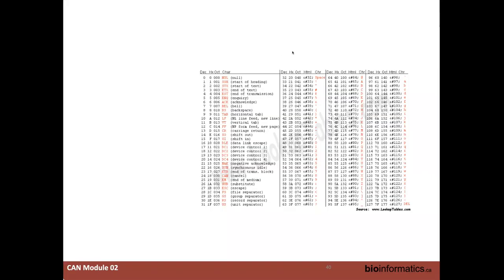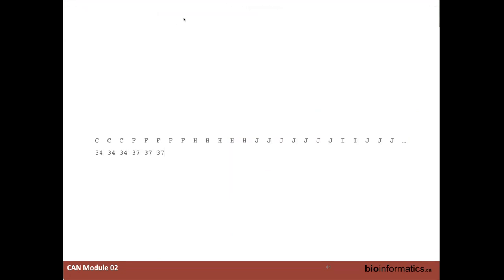Sorry, let me just share my screen again. I don't know what the upper limit is. Most of them, I've never seen anything with a higher quality score of 60. So if we take a look at that 60 and add 33 to that one, then we're dealing with the right square bracket. So that's probably the highest that you'll encounter there. Oh, it does not like me going back and forth on sharing and doing the slide.